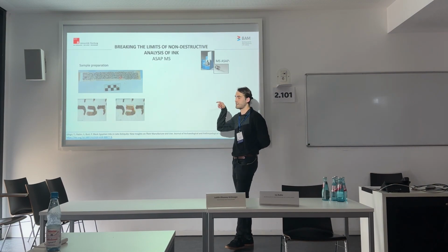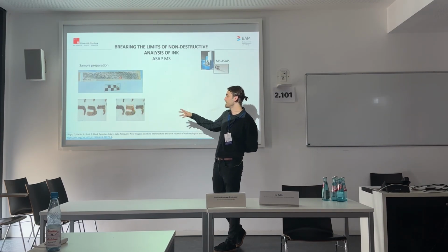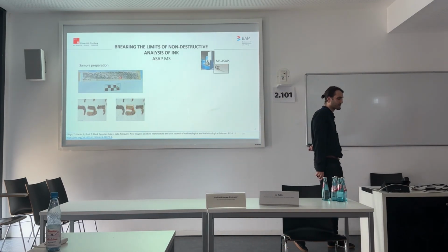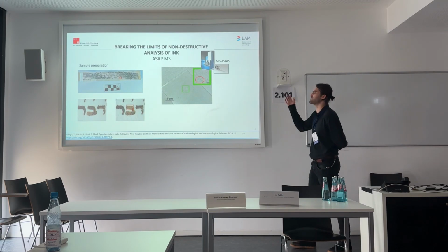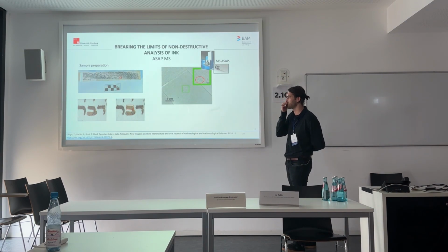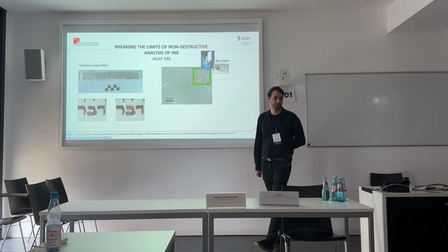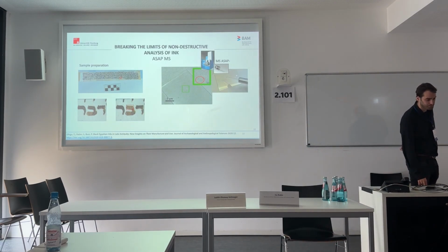If you look at the photograph of the whole fragment, we cannot see what was sampled. However, if we look at the micrographs, this is 50 times magnification, we see that some ink was scratched from the upper part of the letter. However, this amount of the sample was very generous in this case. I collected much more material as it was a sample we could collect as much as we wanted. And to conduct the real measurements, we only need a couple of those little drops of ink to get meaningful information. What kind of information?